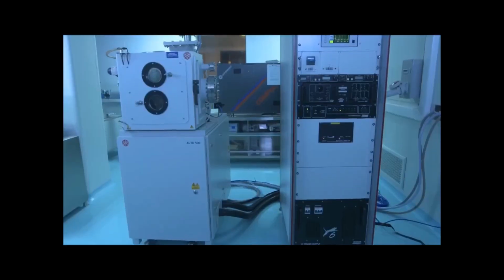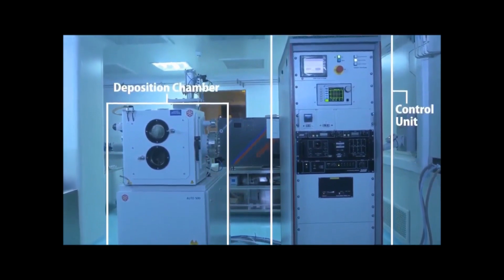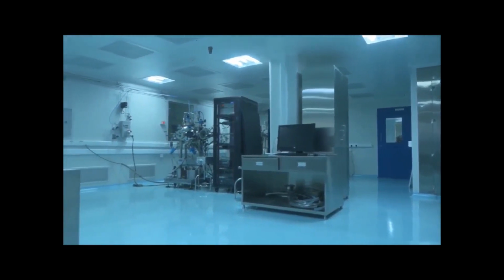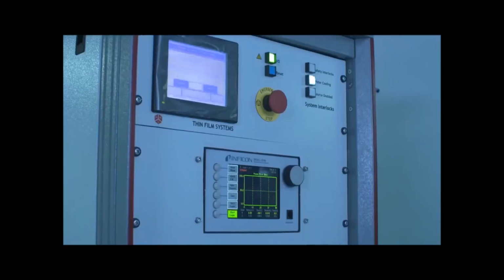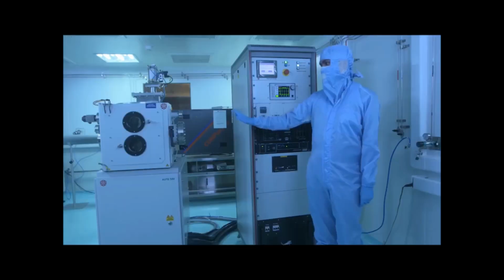This is our E-beam evaporation system. Now I am going to show how this system operates. This system is inside a 1000 class clean room in order to protect it from contaminating dust particles. It has two main units: one is the deposition chamber and the other is the control unit. So let's first try to understand the different parts inside the deposition chamber.